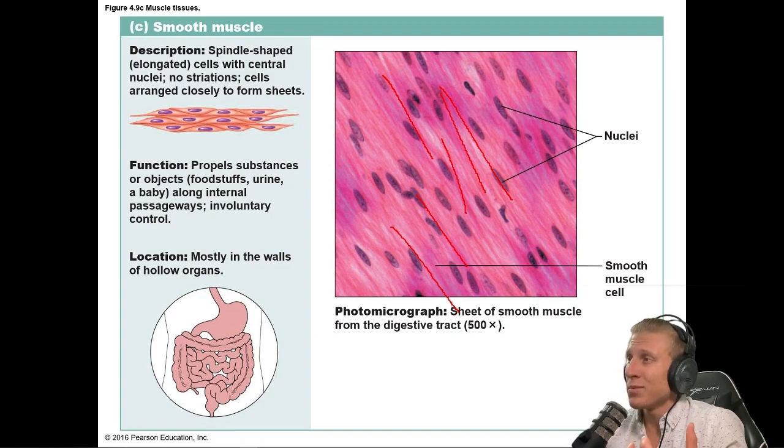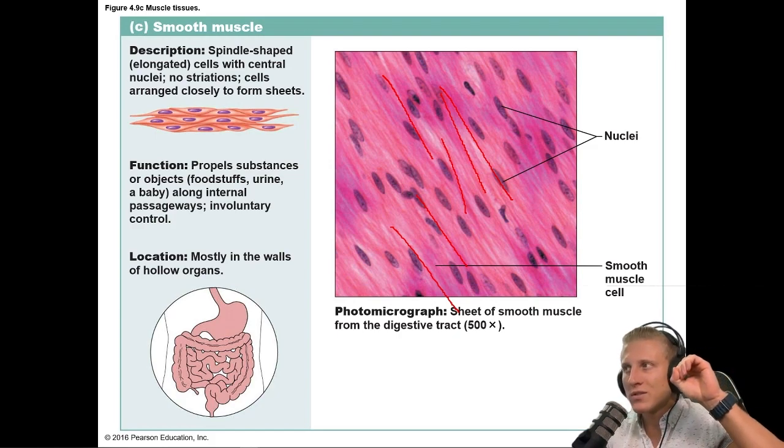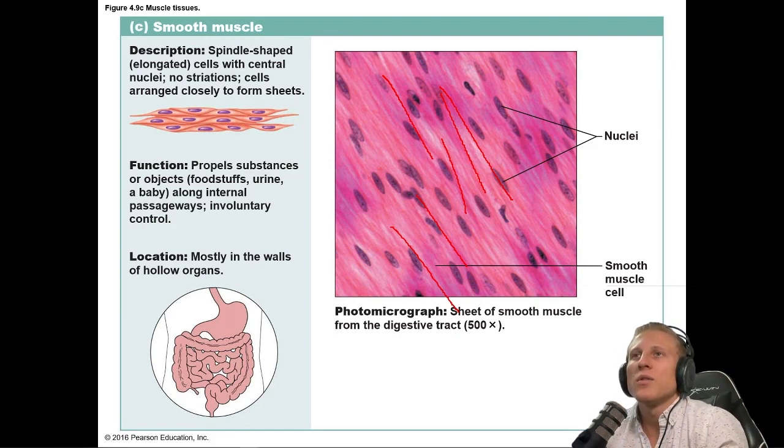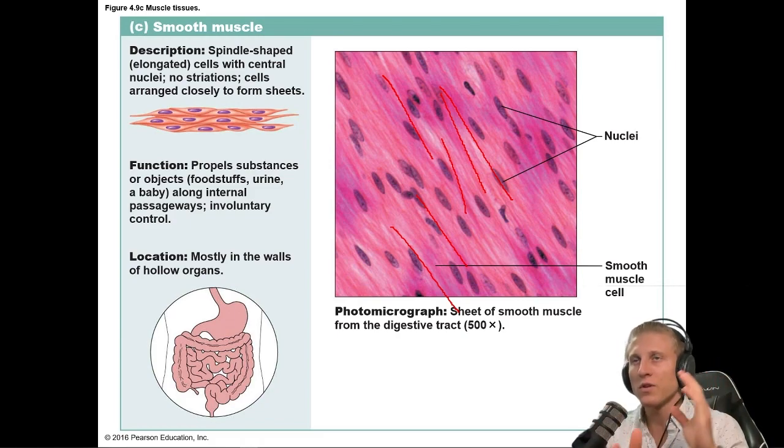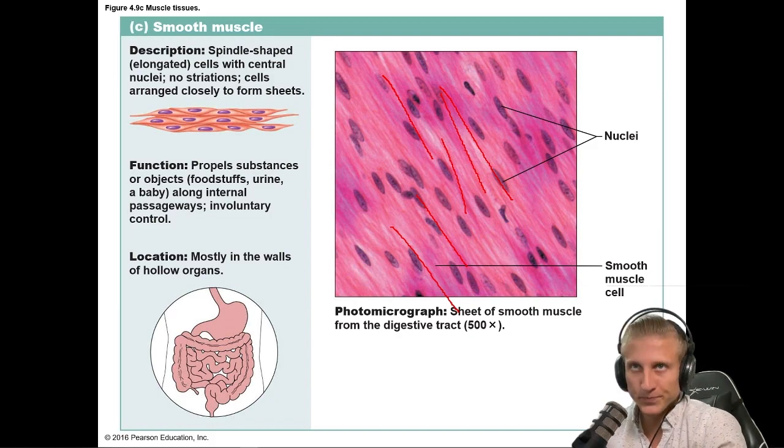If we want to limit blood flow, then the smooth muscle surrounding the lumen of an artery can contract to both increase pressure as well as decrease throughput through that vasculature and divert blood flow to other areas where we will then dilate. We will relax those smooth muscle fibers and allow for a larger volume of blood to flow to a region.